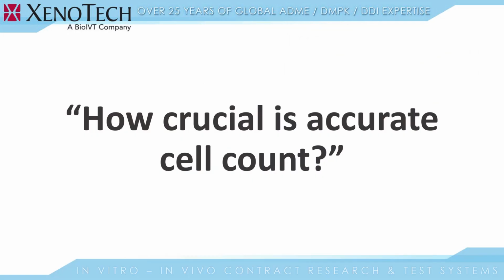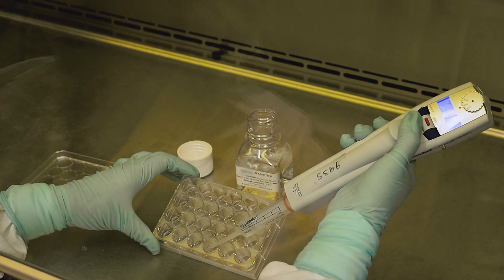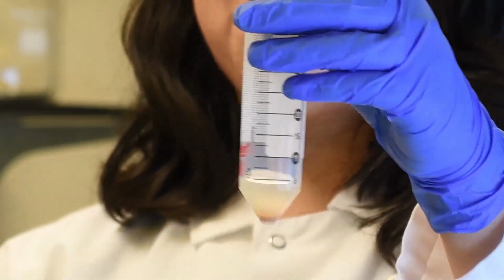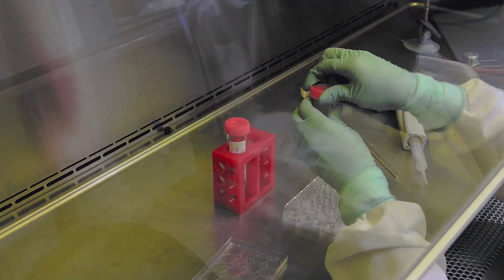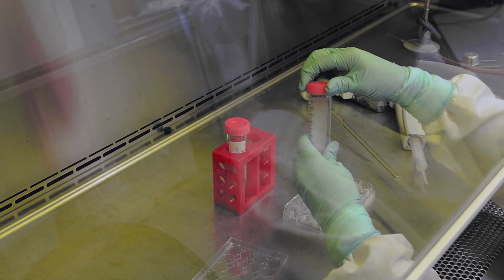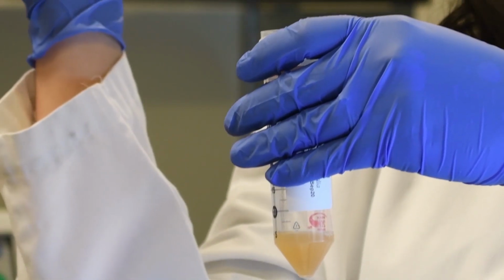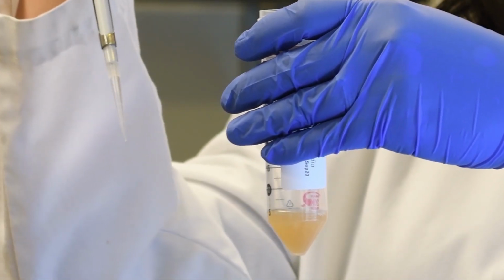Cell counts are essential for successful cultures. Both overseeding and underseeding can lead to underconfluent cultures. So being consistent with your technique can help ensure you have the most accurate counts possible. Hepatocytes settle very quickly. The cells should be resuspended thoroughly, ensuring they are completely mixed before removing your cell count sample. Although your cells should never be vortexed, it's very important to keep your cells resuspended throughout the process. The cell count sample should be taken from around the middle of the volume of your cell suspension. This practice ensures you will not get a pocket of cells included in your count. This would elevate your yield.